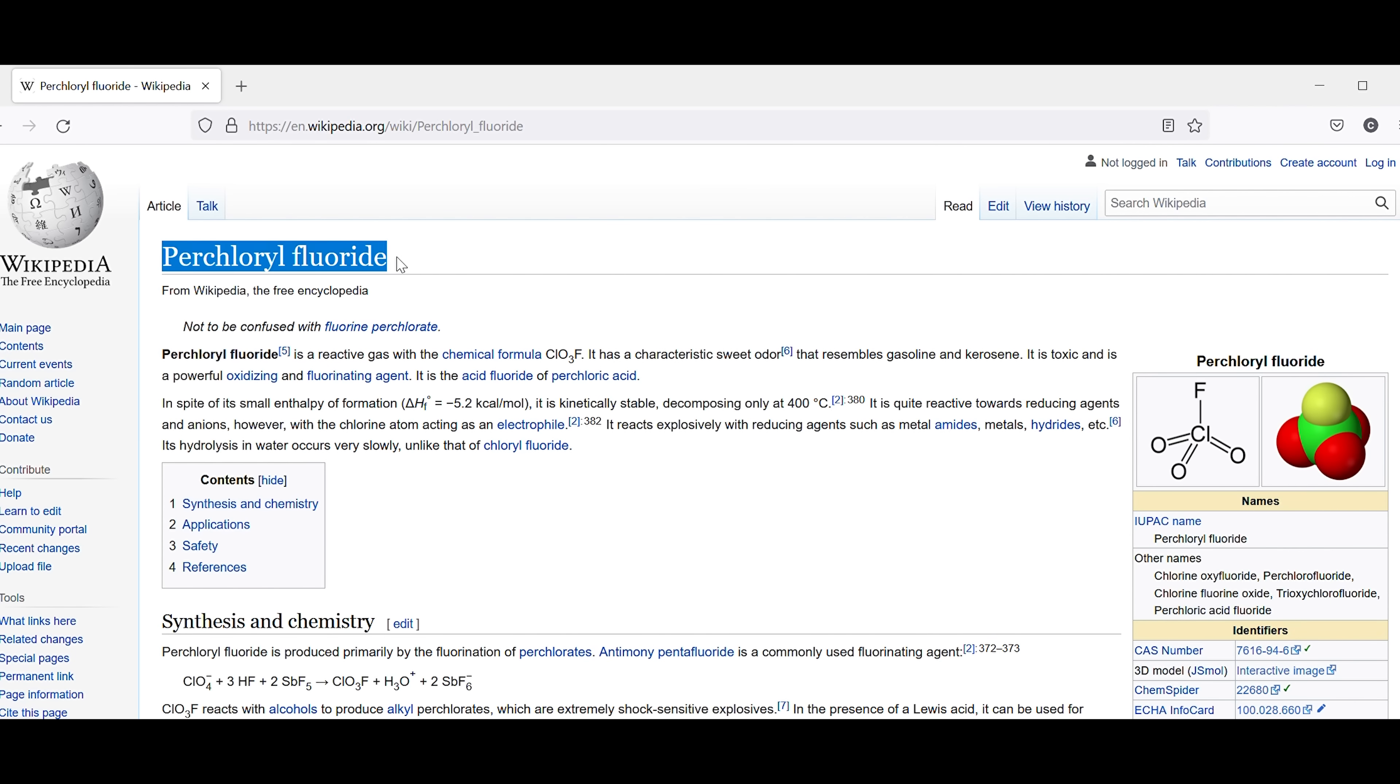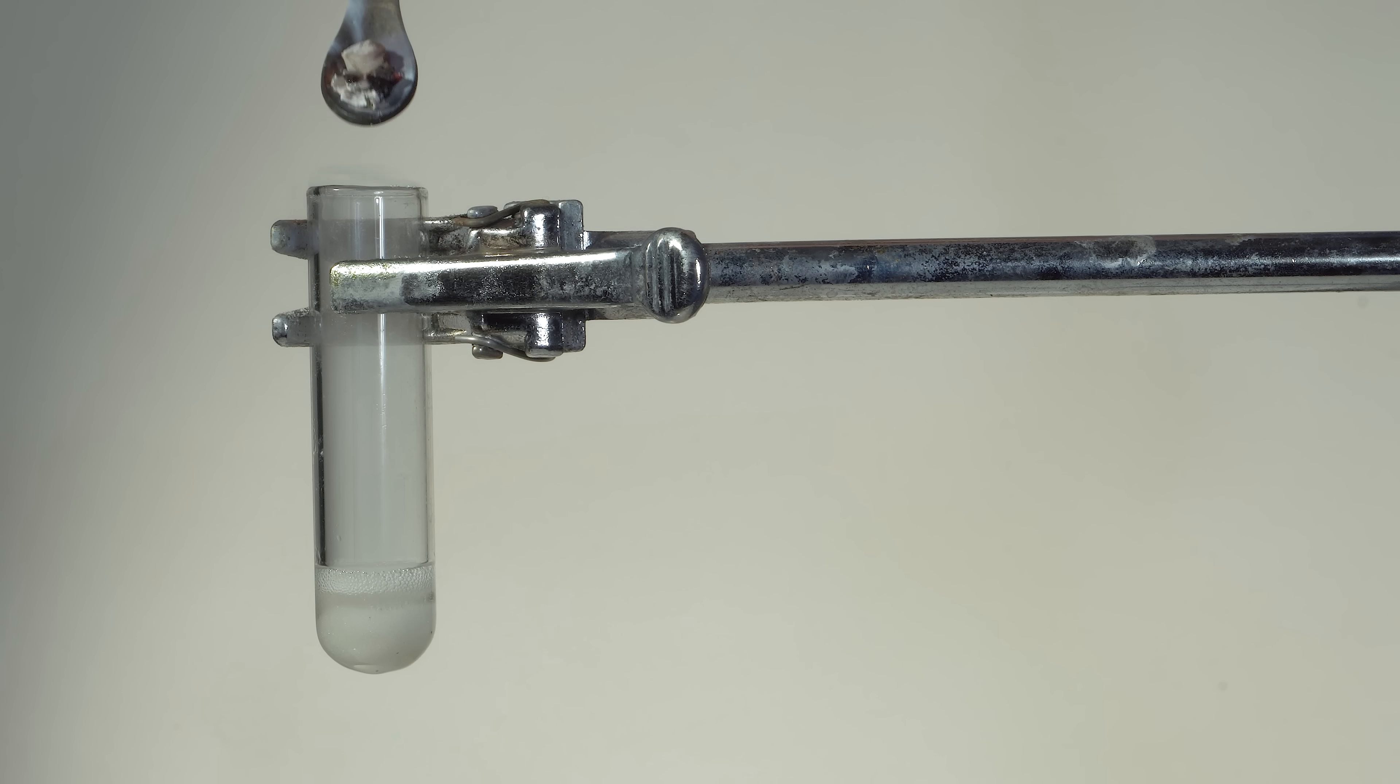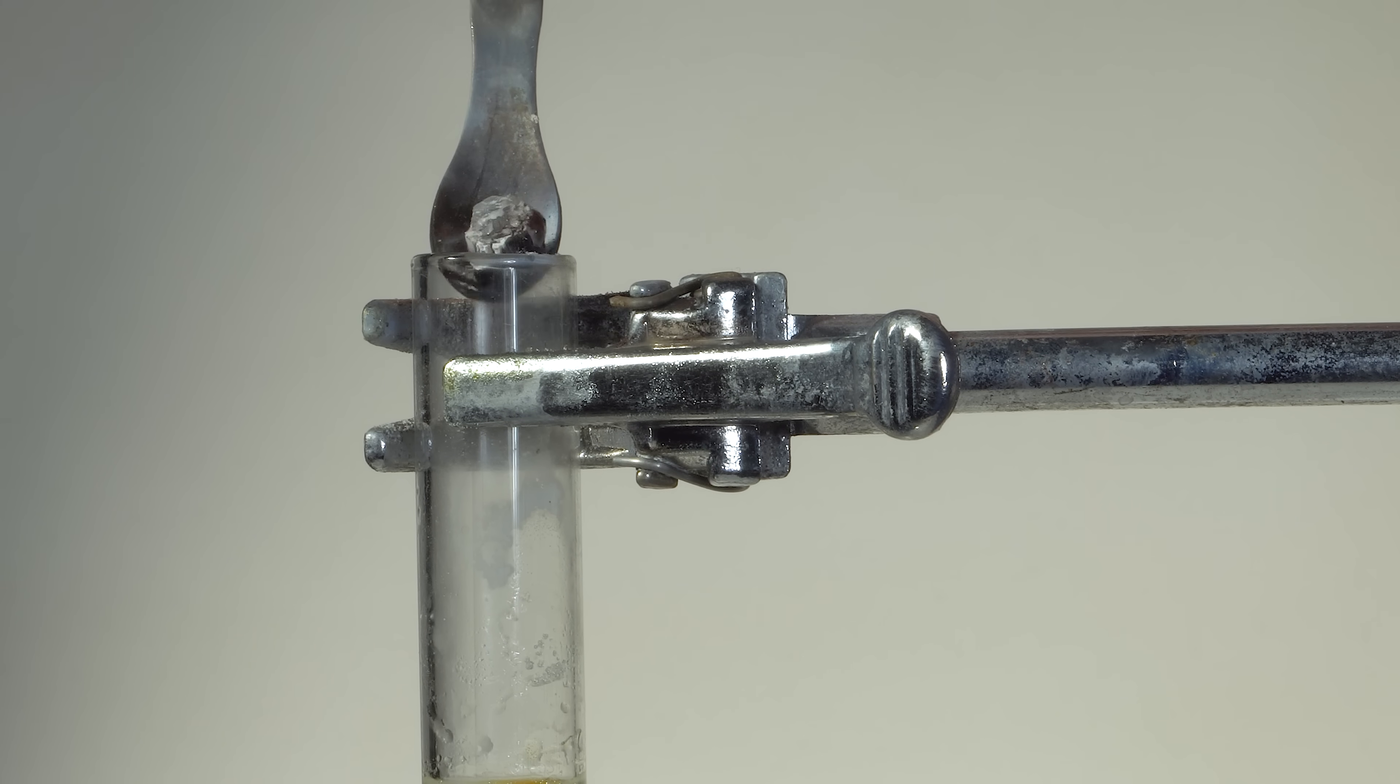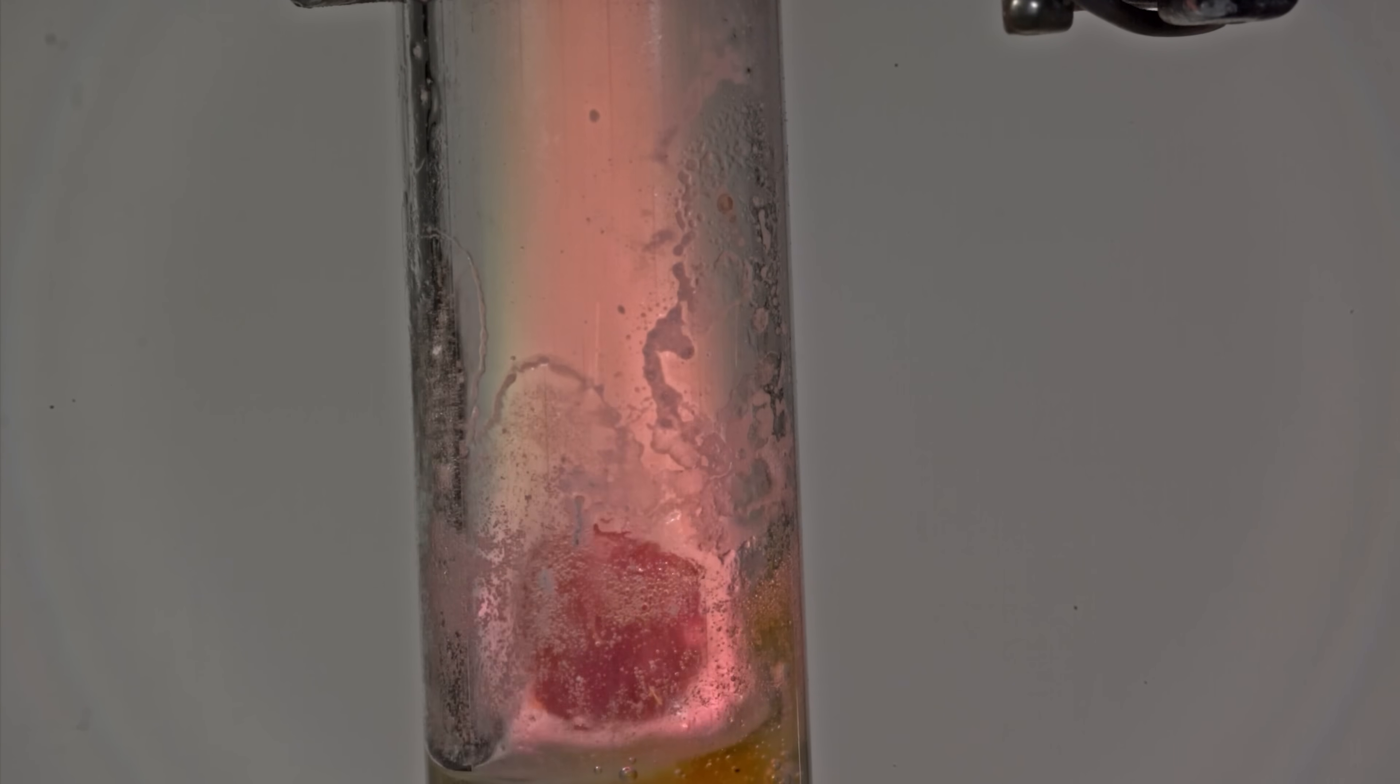Perchloryl fluoride reacts explosively with hydrides. Here I tried to make it contact with heated lithium hydride. And here I just accidentally dropped a piece of lithium hydride.